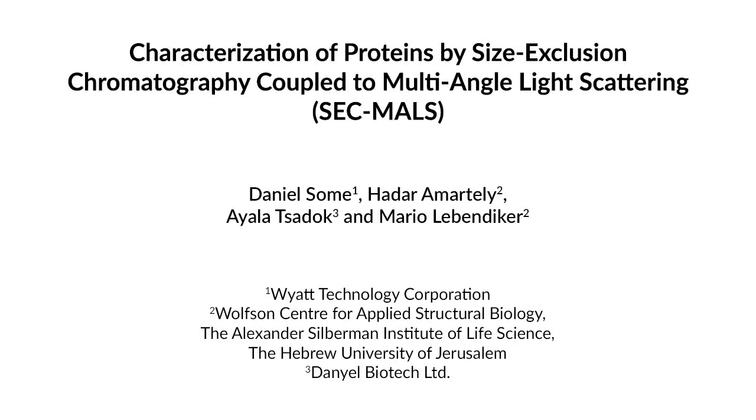SEC-MALS is a quantitative method for determining the molecular weight, size, and conformation of macromolecules in solution. It can identify oligomers and complexes, and characterize difficult samples like glycoproteins and membrane proteins. SEC-MALS is an absolute method.